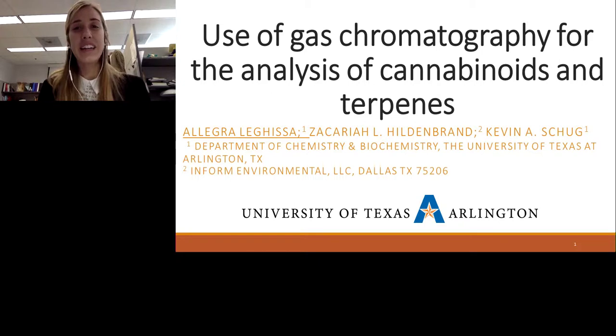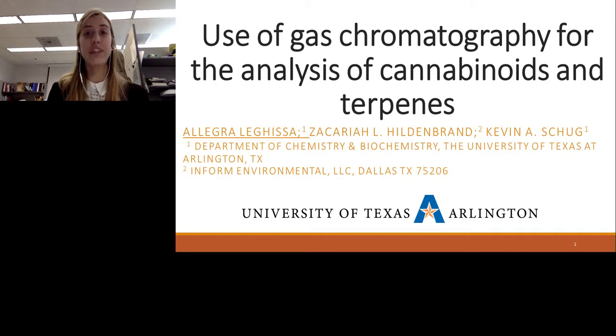I'm Allegra, and as mentioned earlier, I'm going to be talking about the use of gas chromatography for the analysis of cannabinoids and terpenes. But before actually getting into the research itself, I would like to give a small and brief introduction about cannabis sativa and its analysis, about cannabinoids and terpenes, and also about gas chromatography. So there can be a basic knowledge of what I'm going to be talking about.